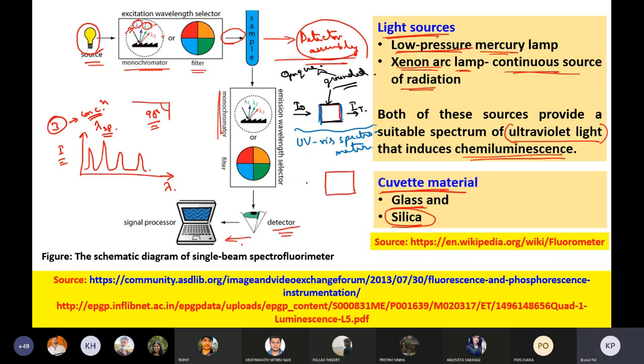in spectrofluorimeter, we measure the emitted light at a 90-degree angle. So in this case, the cuvettes for the spectrofluorimeter are transparent on all four sides. Okay. So if you have a cuvette for spectrofluorimeter, you can use it in UV visible spectrophotometer. However, if you have a cuvette for UV visible spectrophotometer, you cannot use it for fluorescence measurement.